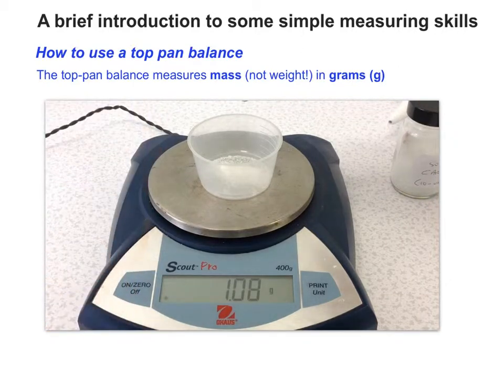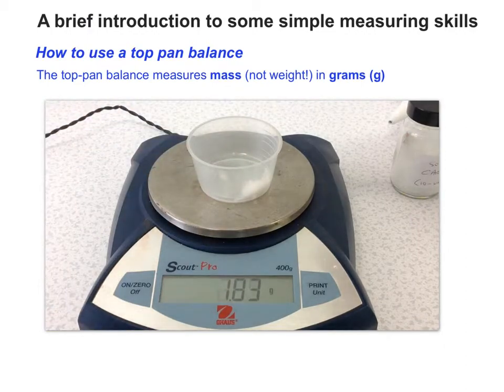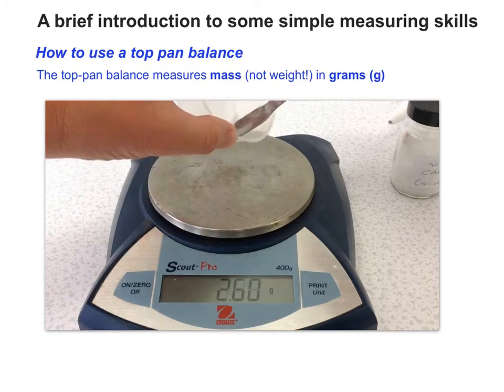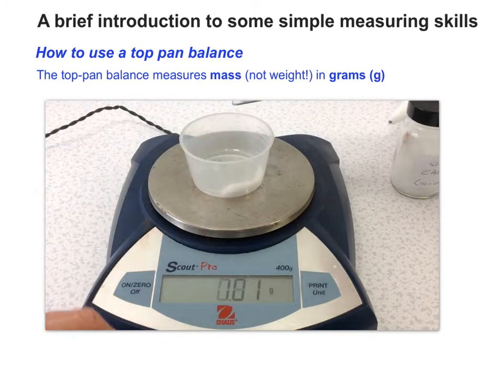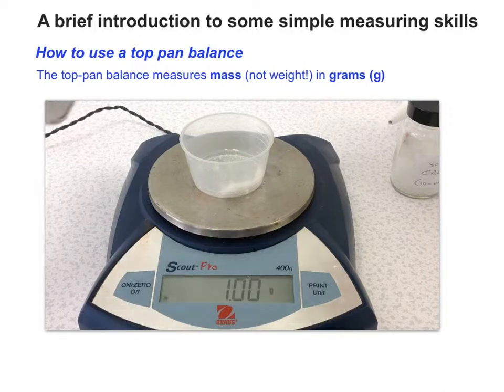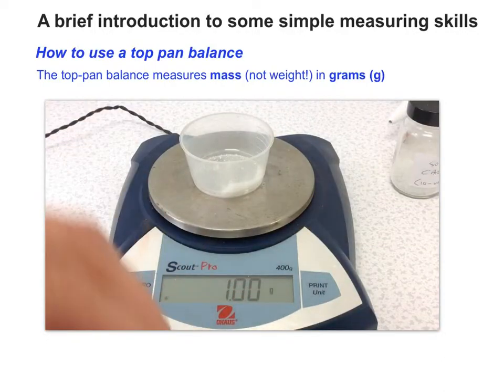Whoops, I put in a bit too much, so I'll take a little bit out. And this bit's quite fiddly, so I'll take a bit more out, and then I'll add it back to get exactly up to the one gram that I'm looking for. There we go, and put the top back on.